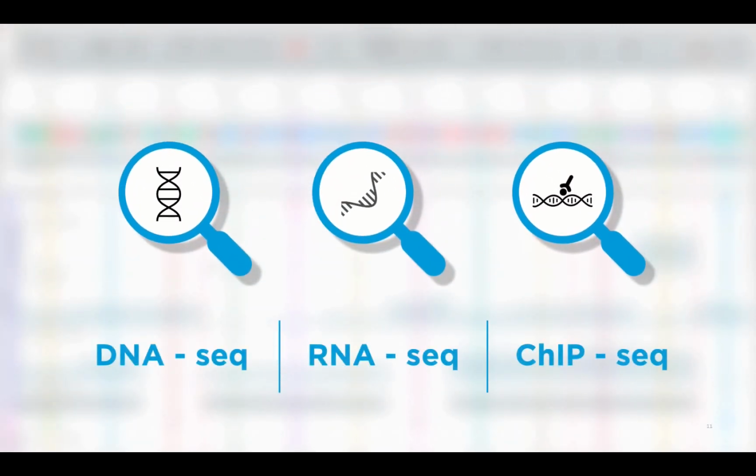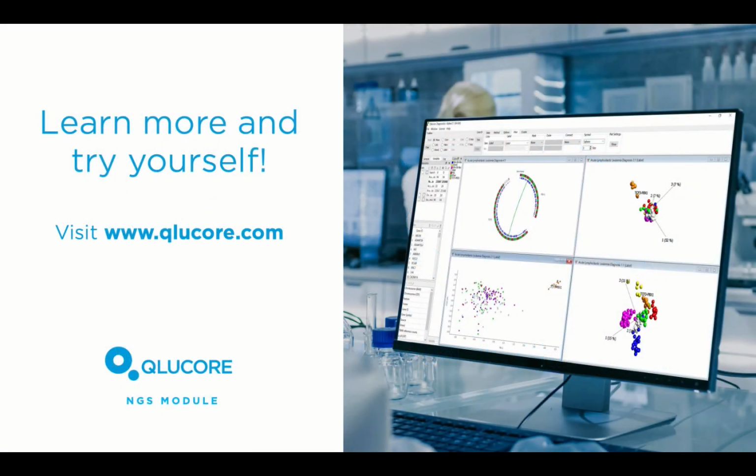Qlucore's NGS module allows the user to interactively visualize genomic data and supports research in comparative genomics, epigenetics, and transcriptional regulation.